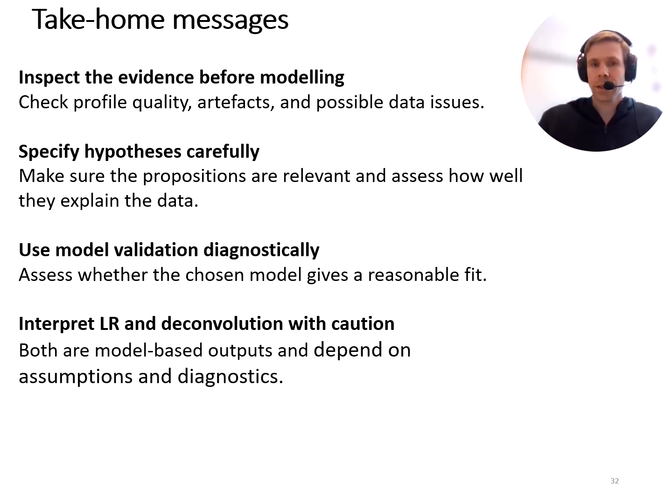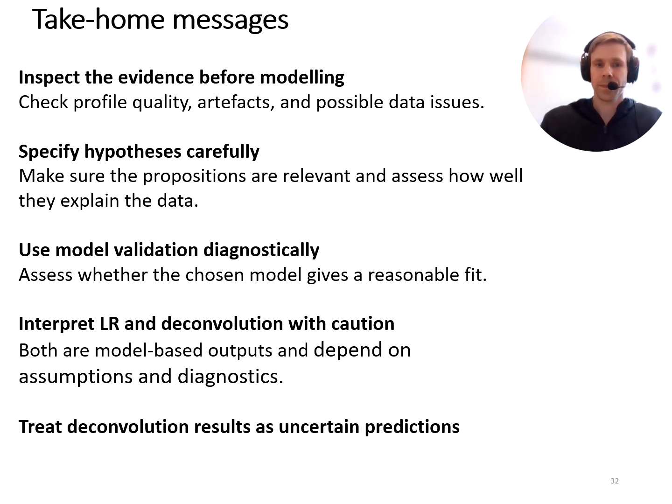Importantly, interpret LR and deconvolution with caution, since these are both model-based outputs and they depend on your assumptions. And treat the deconvolution results with caution, especially if the probabilities are not very high.